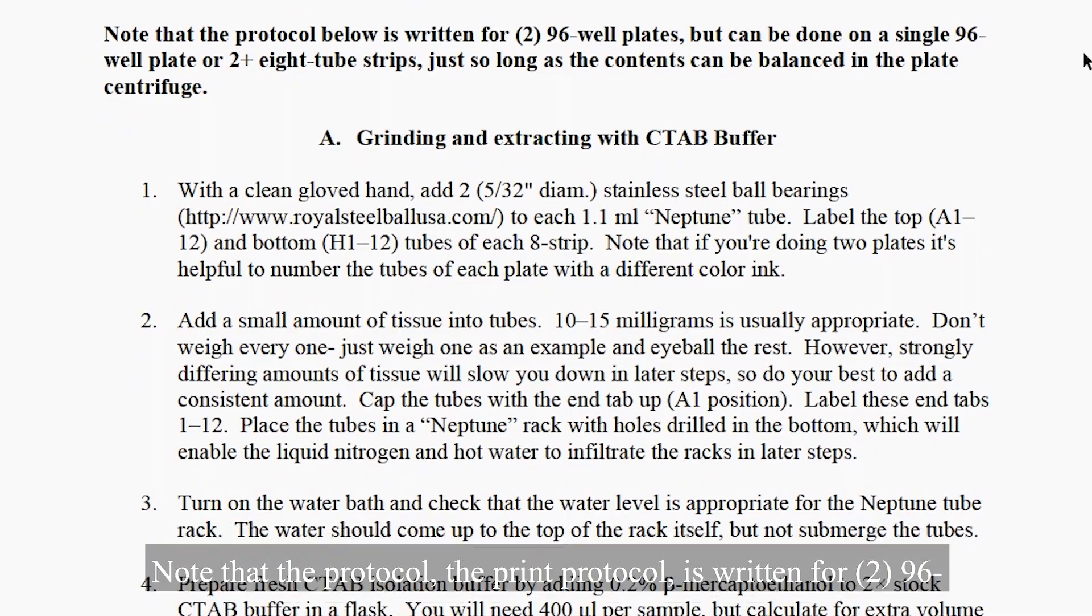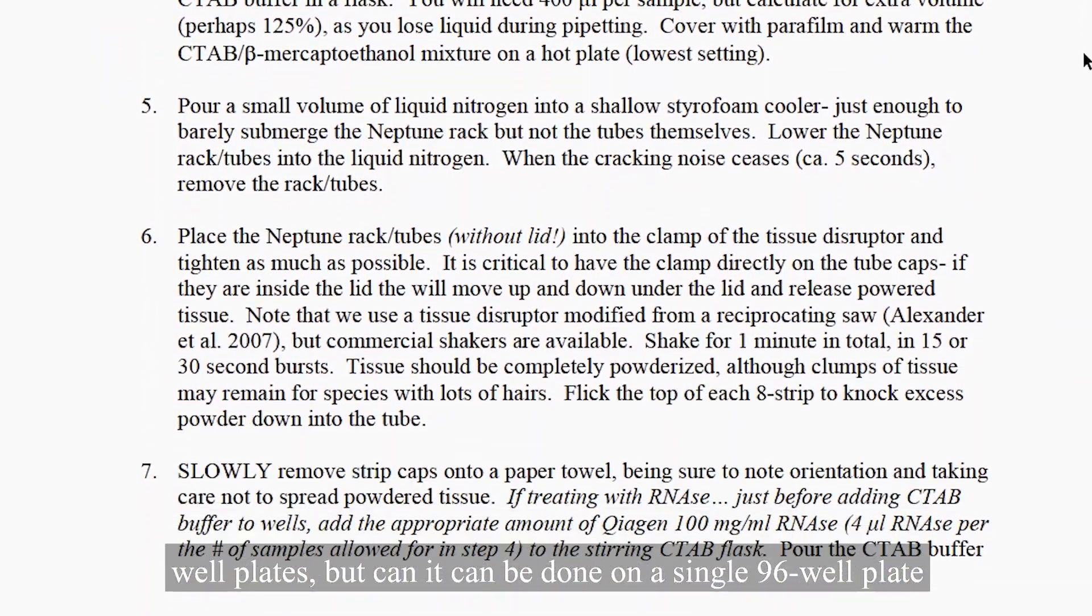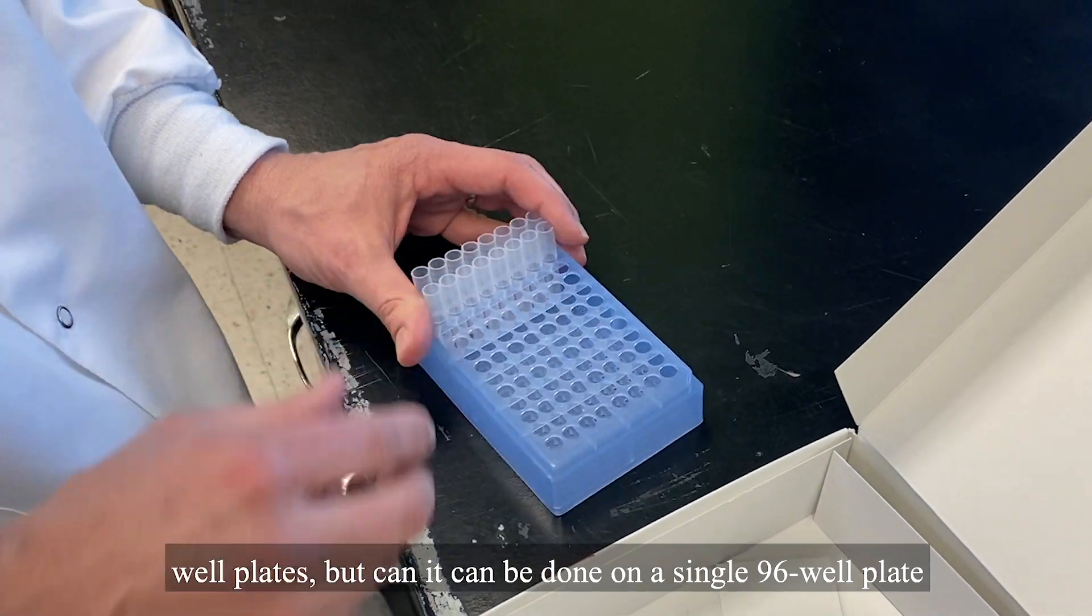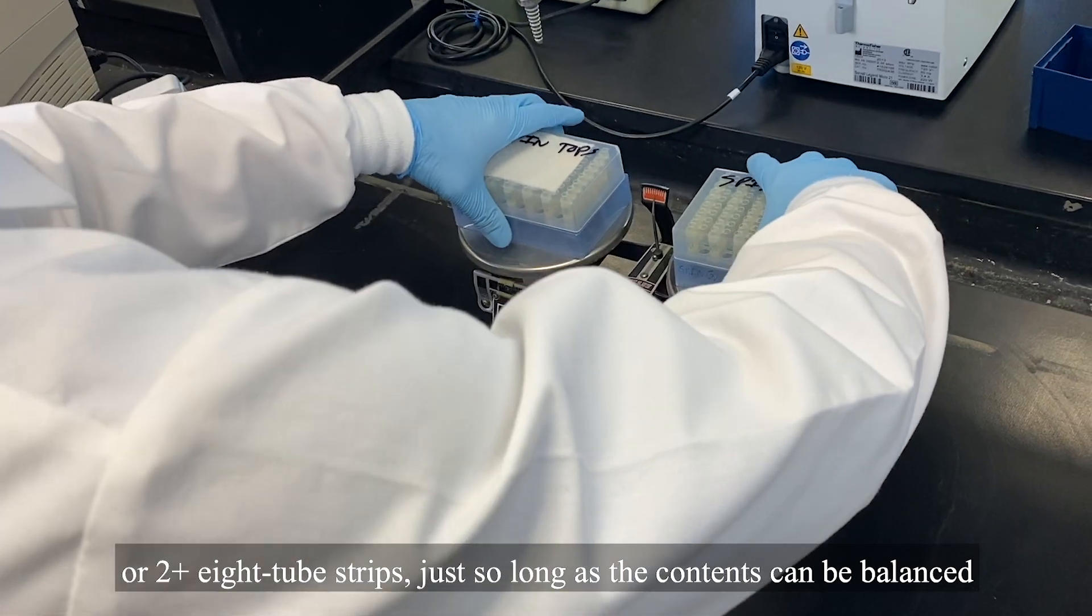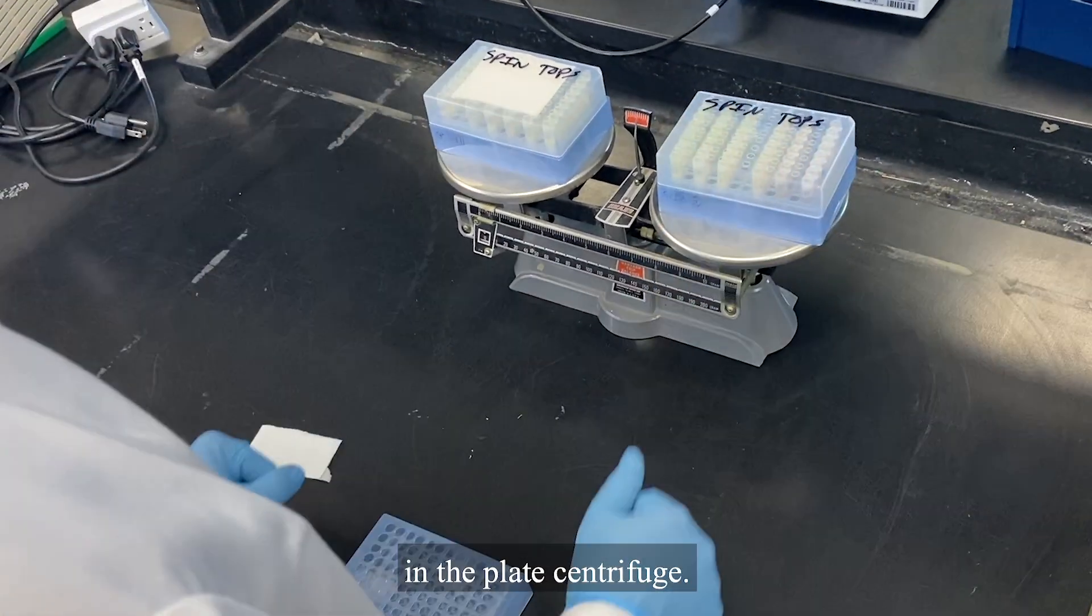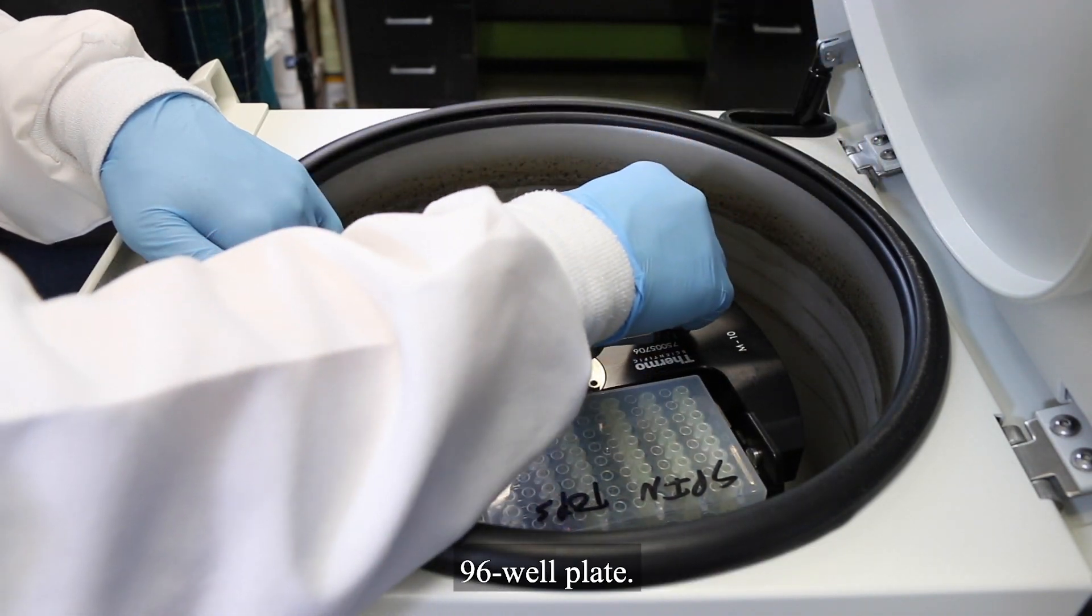Note that the protocol, the print protocol, is written for two 96-well plates, but it can be done on a single 96-well plate or two plus eight tube strips, just so long as the contents can be balanced in the plate centrifuge. In the video version of the protocol, we're doing it on a single 96-well plate.